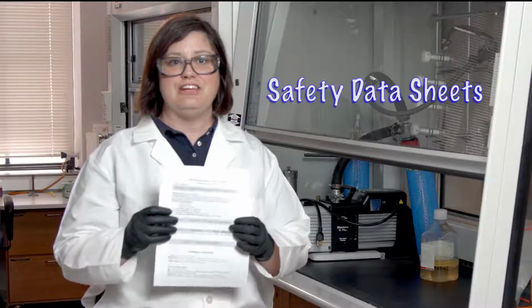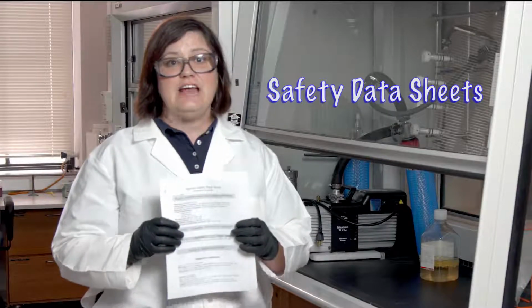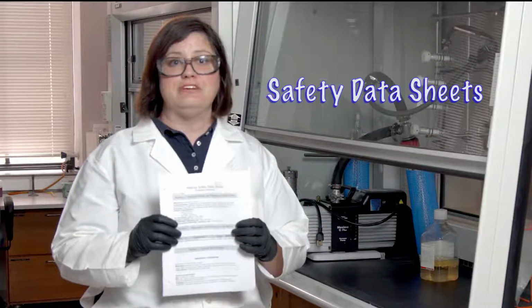Another way to increase awareness of hazards is through labeling. You'll want to label everything, including reaction vessels, wash bottles, and carboys. The final way to communicate hazards is through a safety data sheet. These are sheets of information which include hazards identification and should be available for every hazardous material inside the laboratory. Next, we'll go into recognizing the hazards inside the laboratory and minimizing the risks associated with working in a lab.